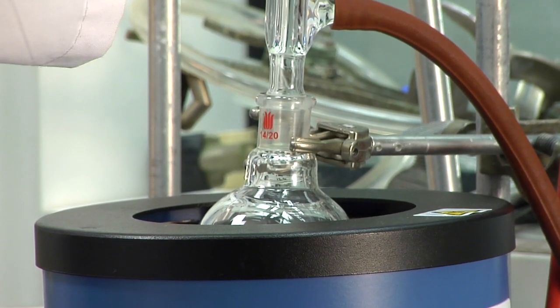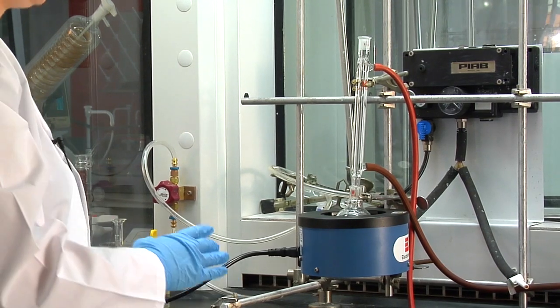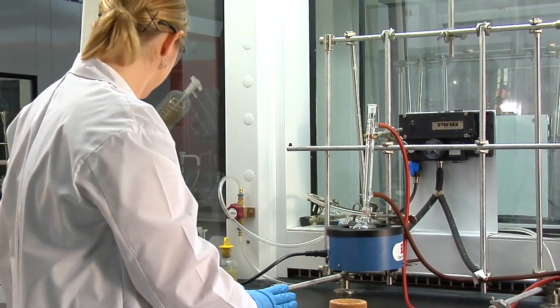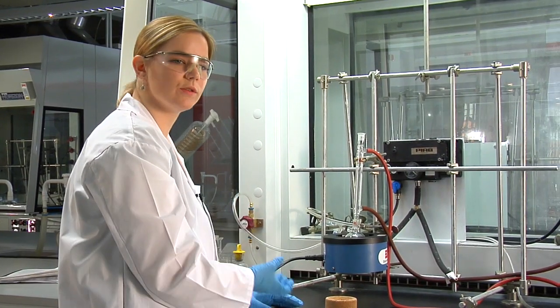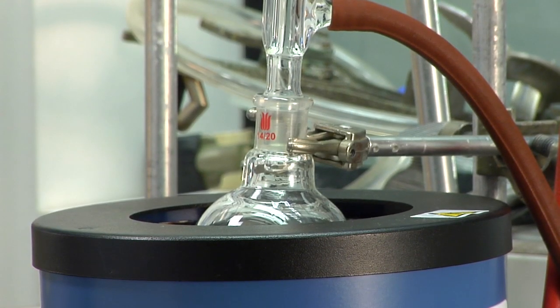And there we go. So now you're going to turn on your heat, and remember that you're plugged into the variac, not the regular plug, so we don't blow a fuse. And so we're going to start to heat this up. And you want to bring it to a boil, but you don't want it to be boiling too much so that there's bumping. And we're going to heat this up in reflux for 1 hour.